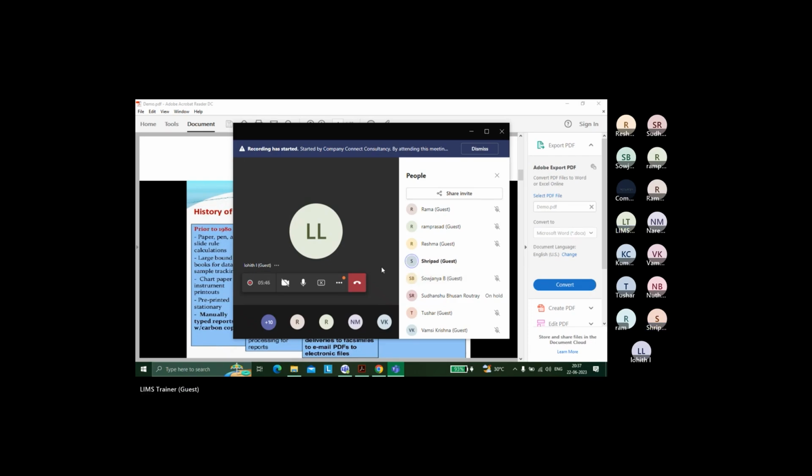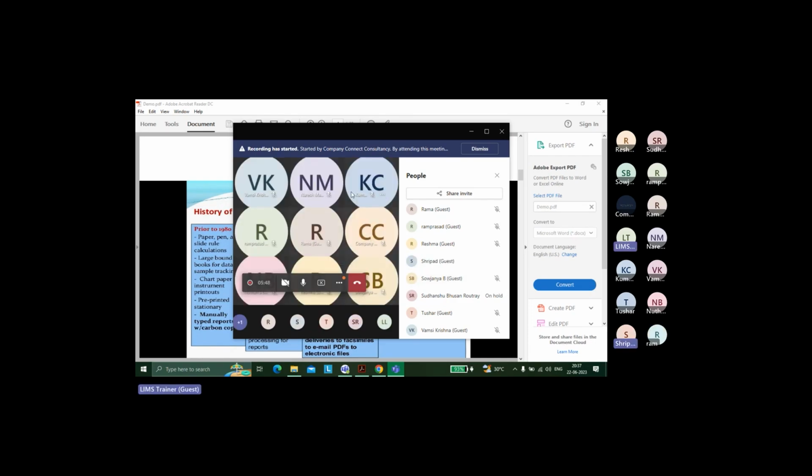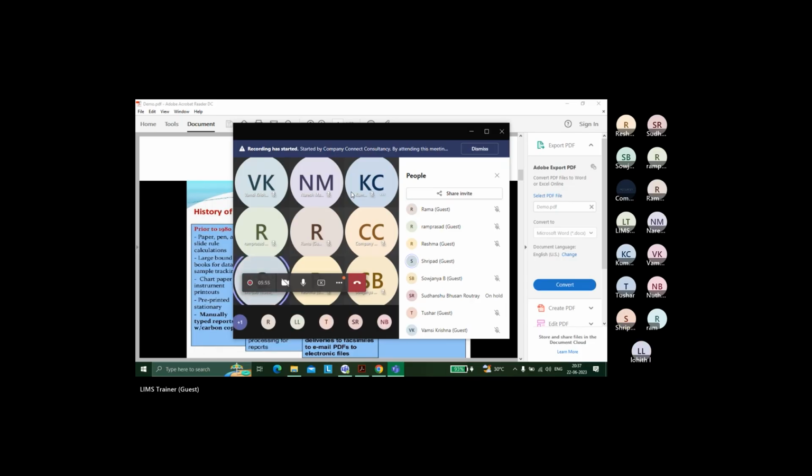Okay. Now someone asked me something. Now you can go ahead. Actually, we have used Caliber LIMS. Caliber LIMS is also a very good LIMS, but there are different kinds of LIMS. So it's properly a laboratory information management system. Say suppose a formulator will place a request for a particular test or particular analysis. I'm also an analytical person, and I will get the request from the formulator, and then I will start my analysis.